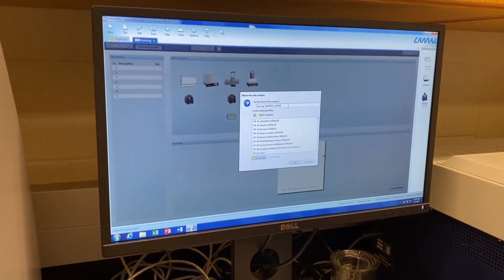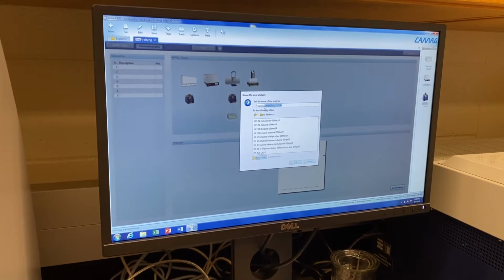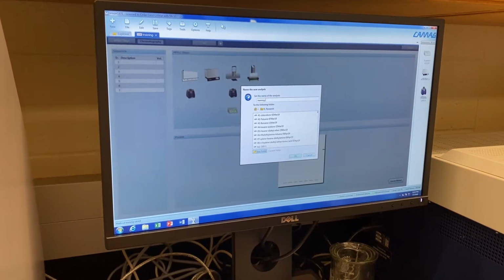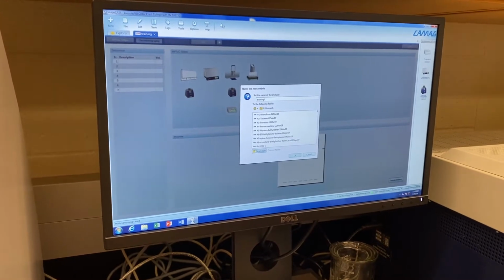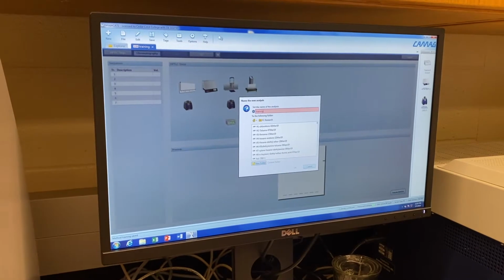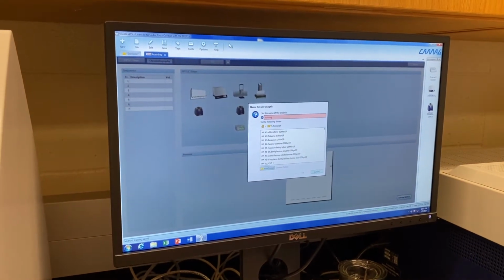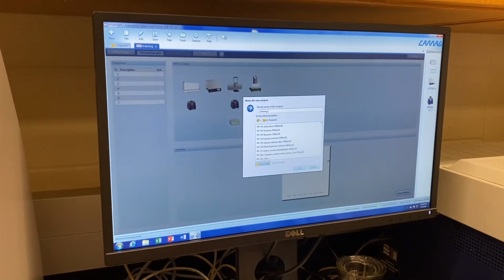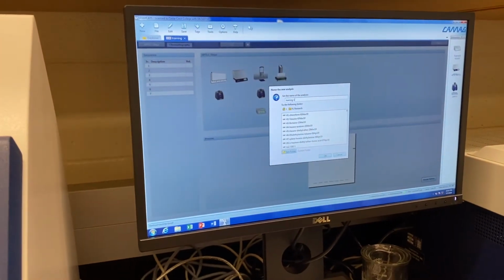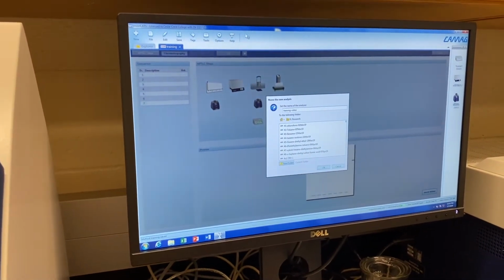So you need to name your analysis. I'm gonna name it training. If it has the same name as the method, it's gonna show red, so you know this name is not working. Training video 7.